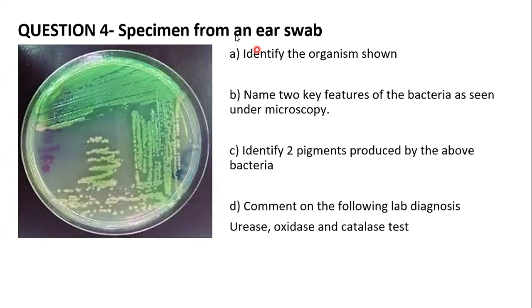I'm not sure, unless I check. Let me see. Although I'm not sure. Okay. Can we see motility under microscopy? Yeah, you can actually see it. Oh, okay. Yeah. Thank you.